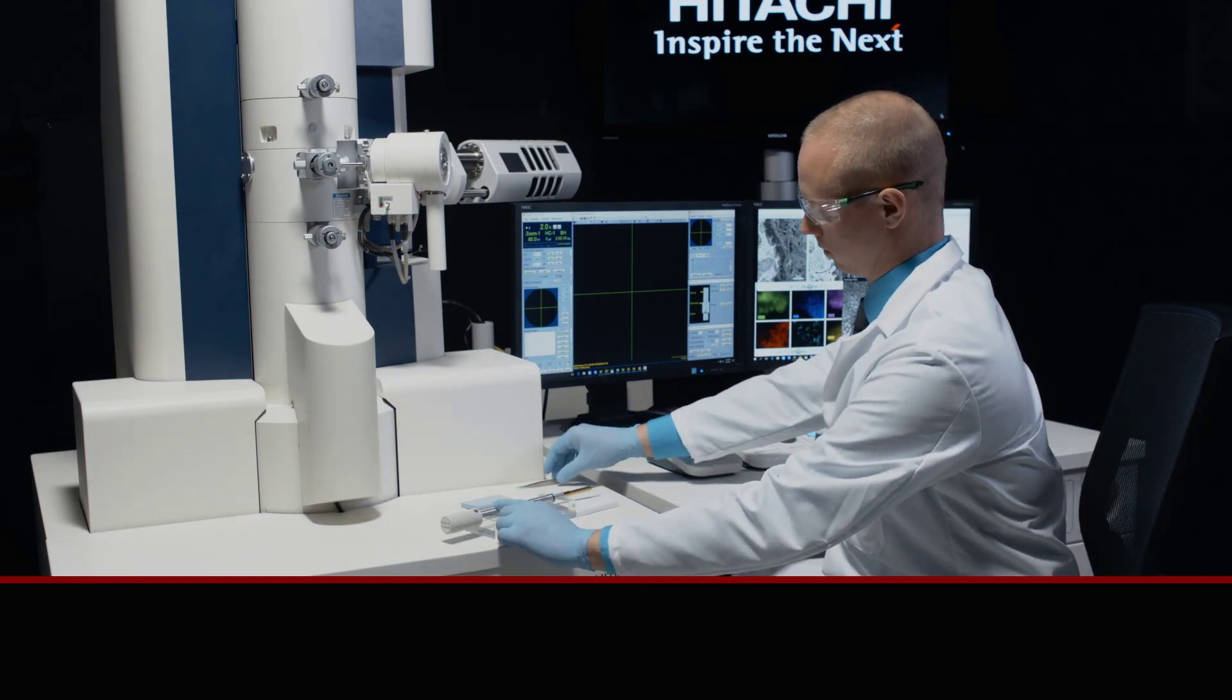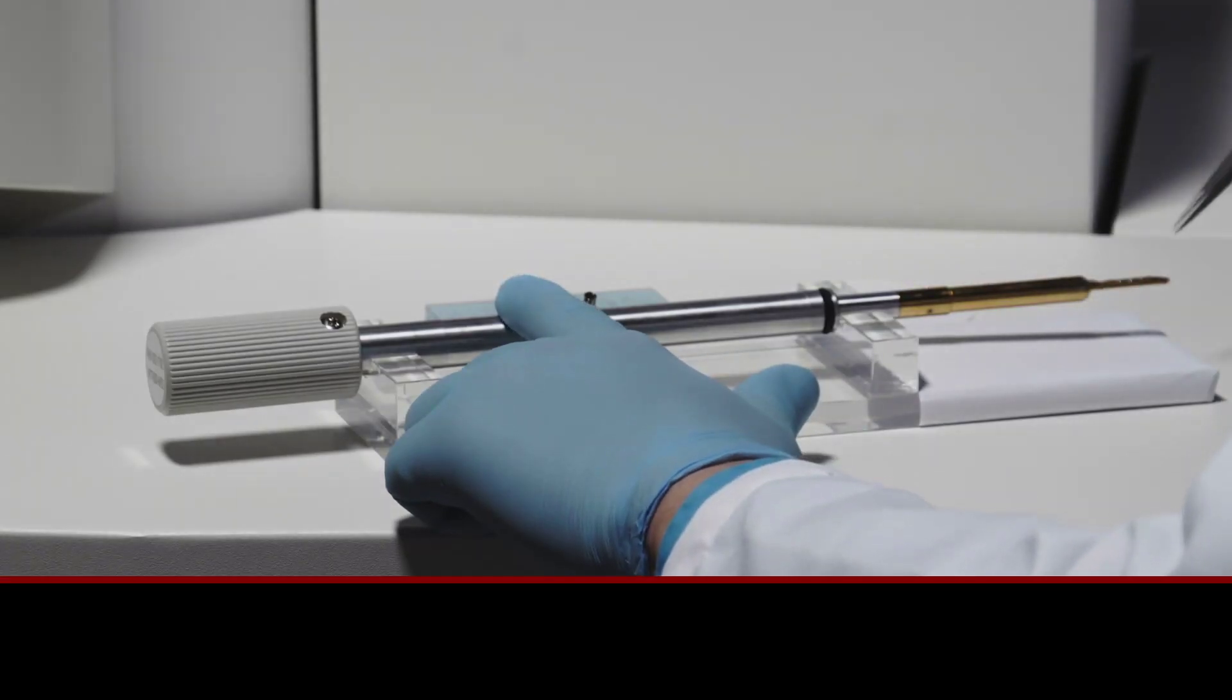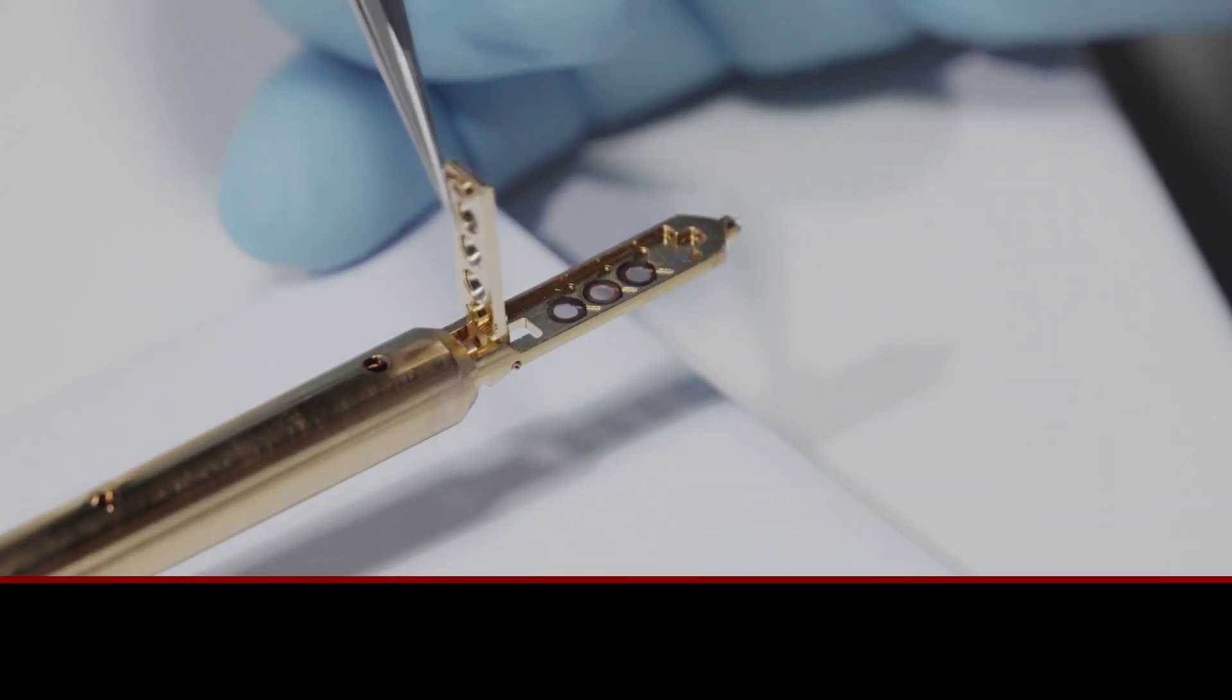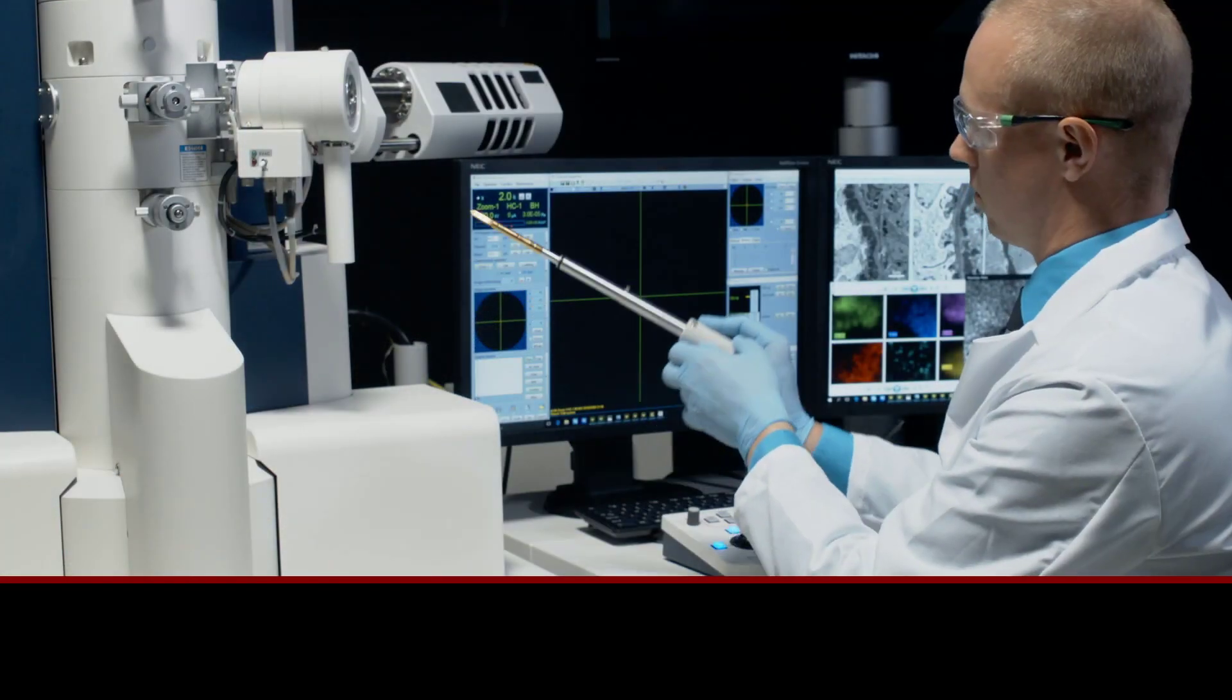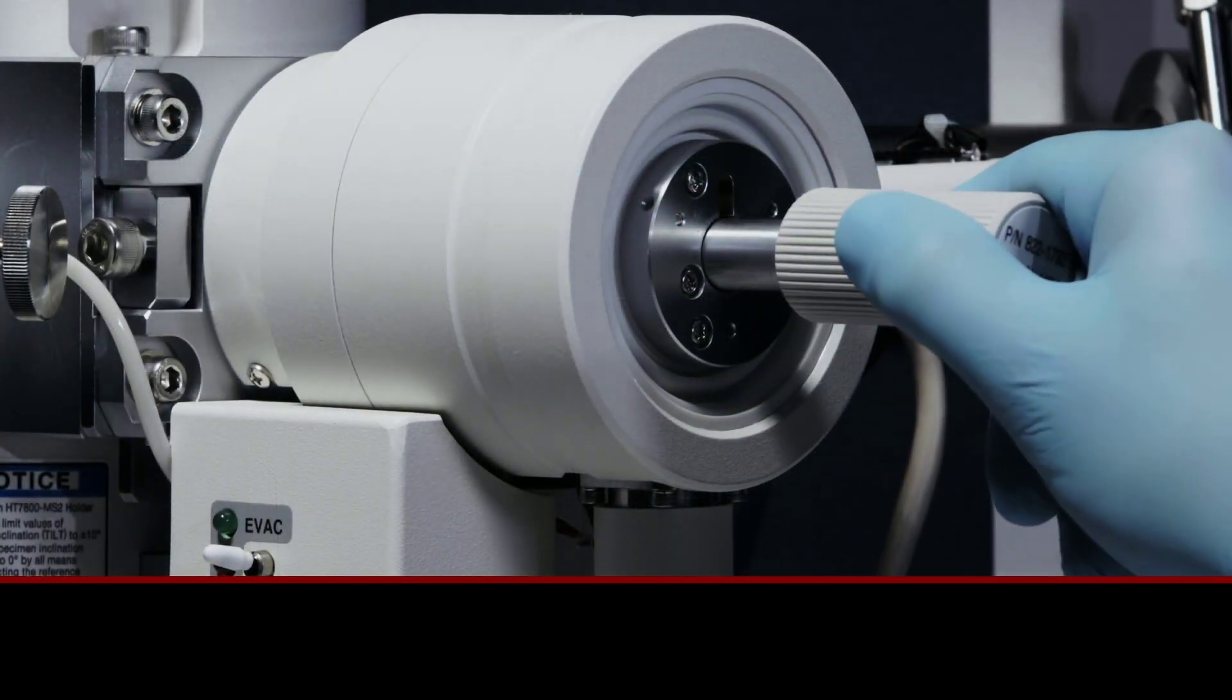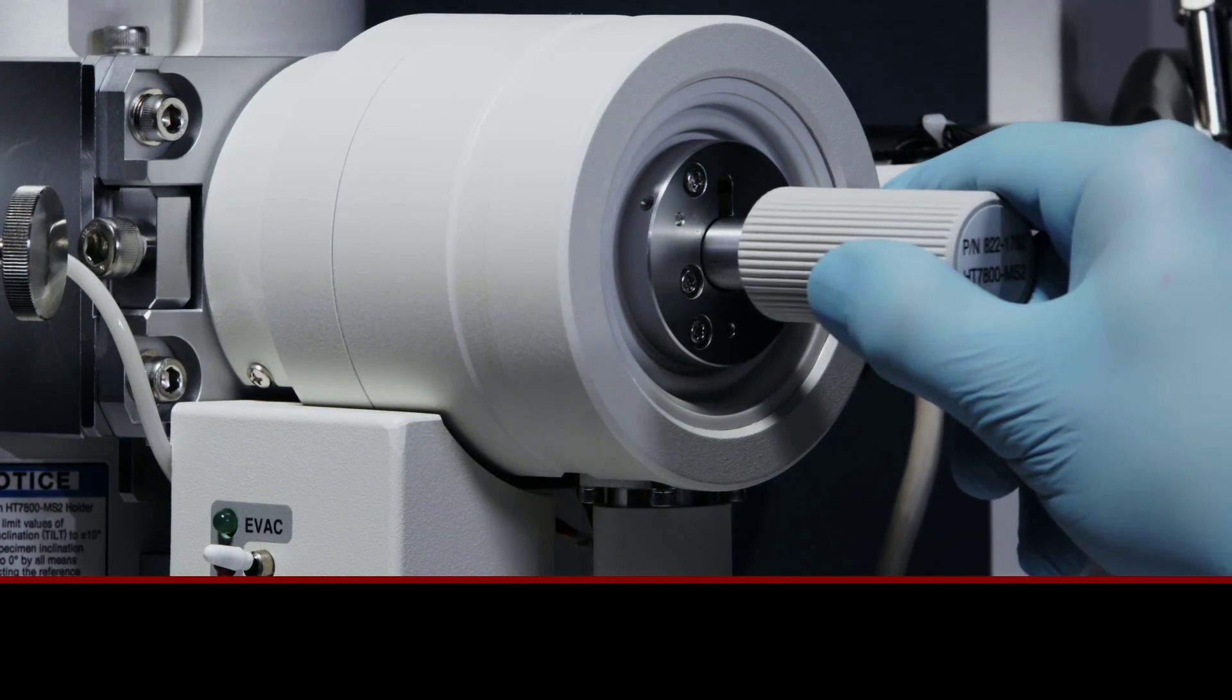Engineered with operators in mind so both experienced and new users alike can attain high-quality data with ease in order to support a wide range of applications including biological, medical, and material samples. The HT7800, a modern microscope for modern applications.